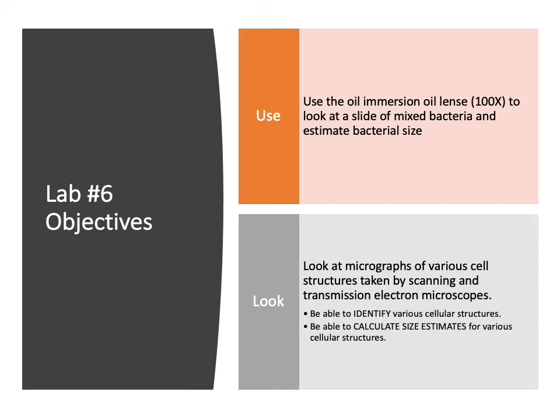And really the majority of your lab, you'll be looking at micrographs of various cell structures taken by both scanning and transmission electron microscopes. And you're going to use those to both identify various cell structures, but also to calculate cell sizes. So we have some math again this week, but a lot of it is math we've already used, and I'm going to show you how to use that. But since we are looking at the cell, and since we're going to start discussing the structures that we find inside the cell, I think it's useful to introduce you to some of the key ideas that exist around biology and our understanding of the cell.